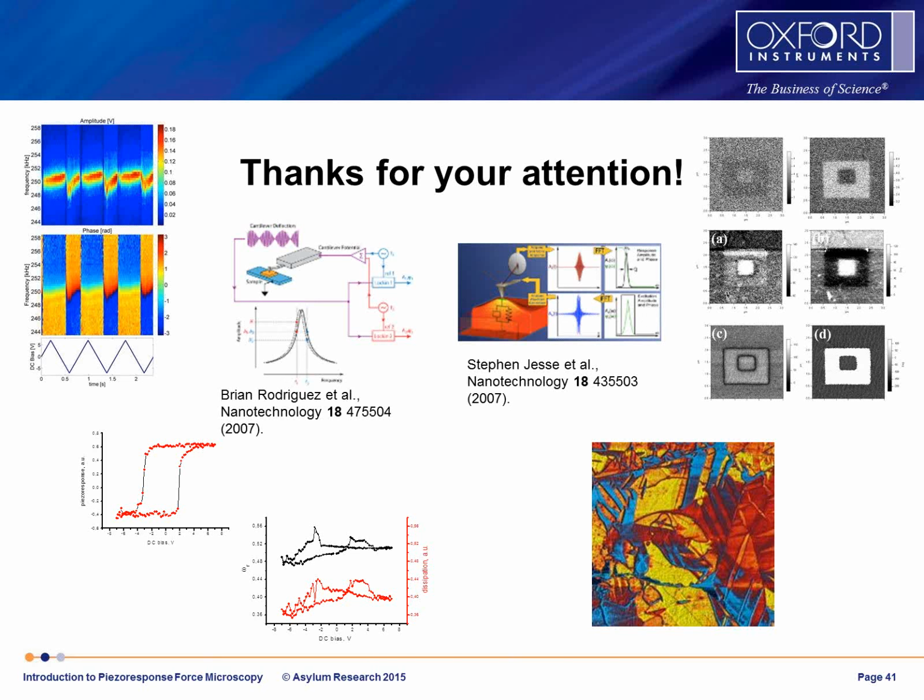Okay. One other question, again for you, Sergey. Why is the amplitude for both domains not exactly the same? This is actually a very interesting question. The correct answer is that we don't know in detail. There can be responses both due to the microscope and due to the fundamental physics of the surfaces. Roger can comment on the microscope-dependent responses in more detail because he has studied in detail using this beam scanning across the cantilever approach.